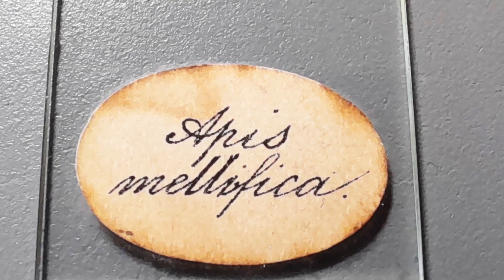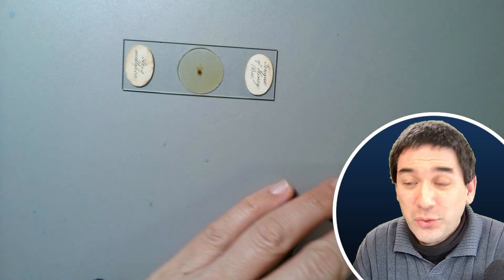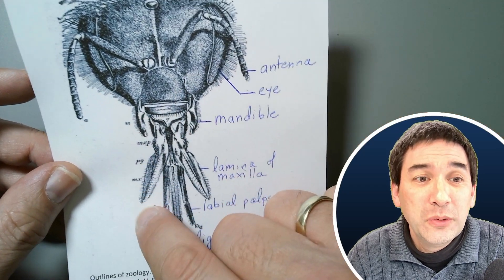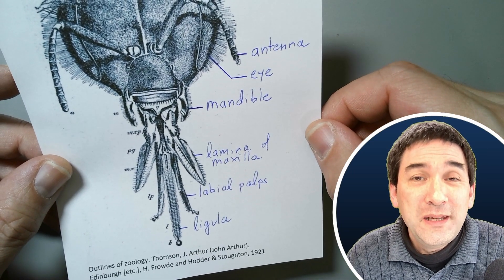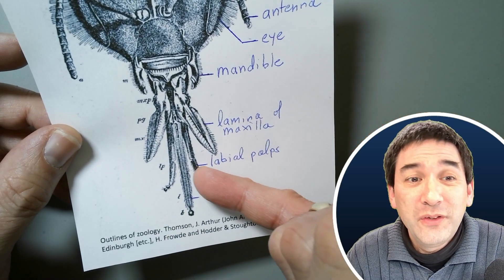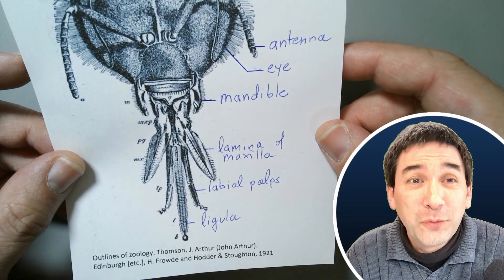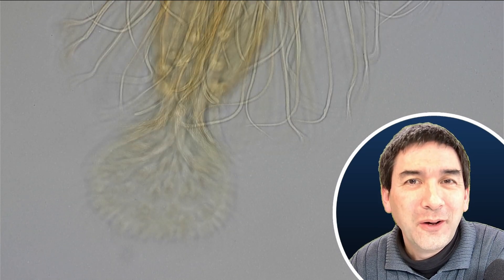This slide is made to last for centuries. I did a little bit of research and I would like to now show you a drawing, also 100 years old, that I found. This is a drawing of the head of a honeybee, and this is the part that we looked at. As you can see, there are many different components to the mouth parts of a honeybee. All of those hairs we see are probably connected to sensory receptors, necessary for sensing touch and maybe even chemicals, important for collecting nectar. We are now looking at the tip of the tongue of the honeybee.